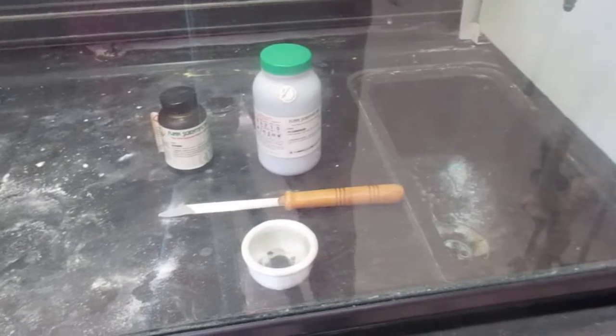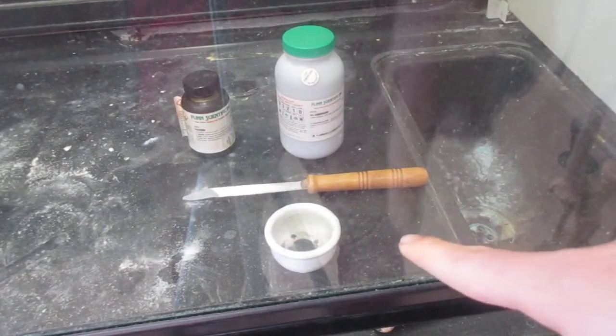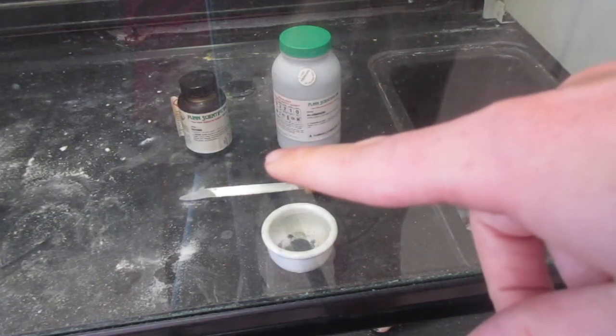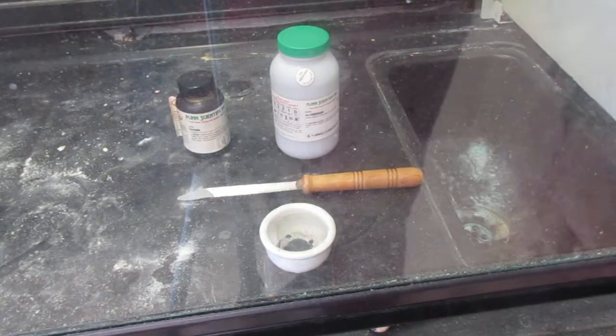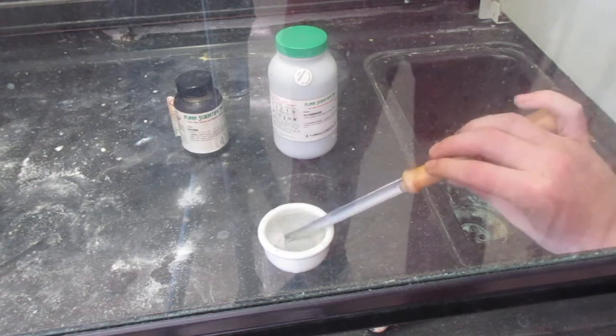The iodine — which I showed in another video with sublimation — is inside this mortar and pestle. Here I have powdered aluminum already loaded on the spatula. What I'm going to do is add the aluminum. It's just aluminum and iodine.